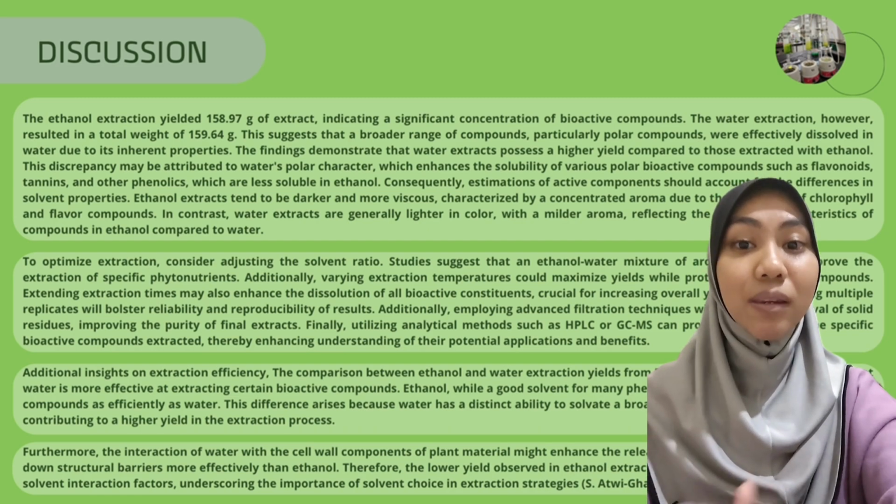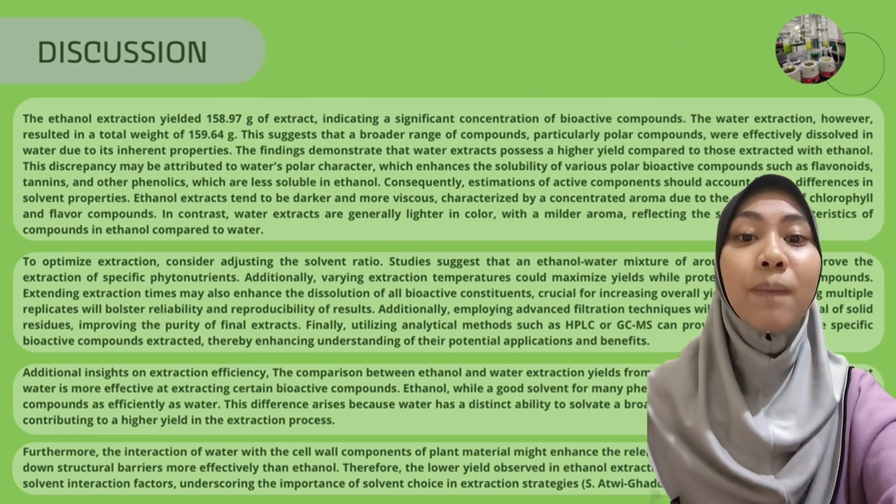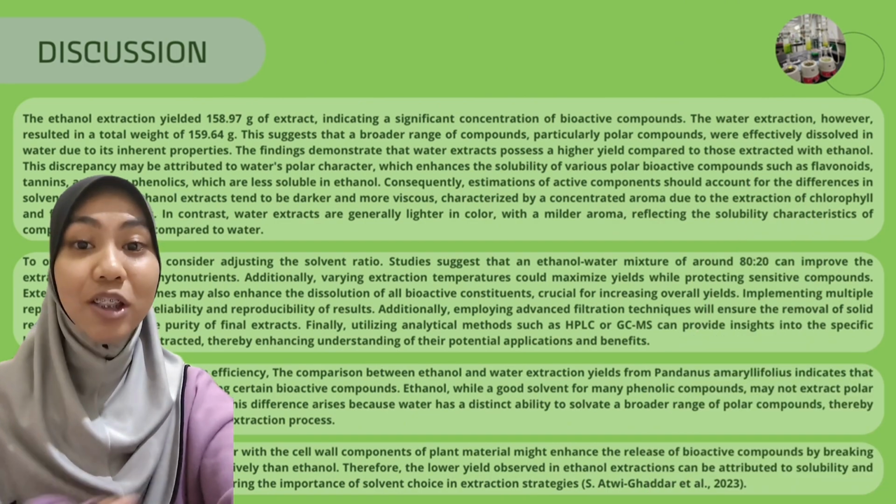Finally, utilizing analytical methods such as HPLC or GC-MS can provide insight into the specific bioactive compounds extracted, thereby enhancing understanding of their potential application and benefits. Additional insight on extraction efficiency.